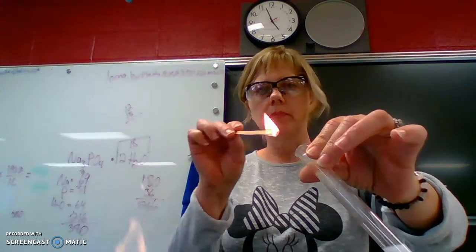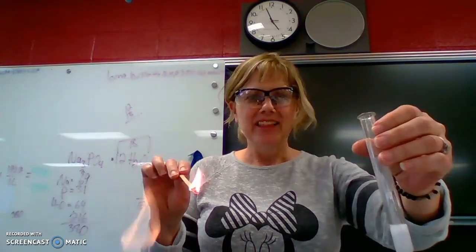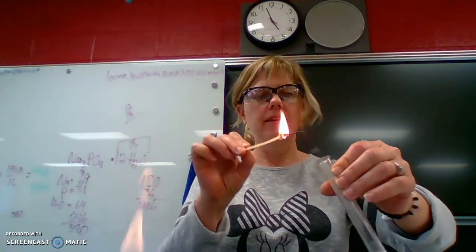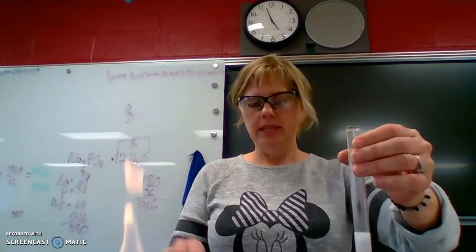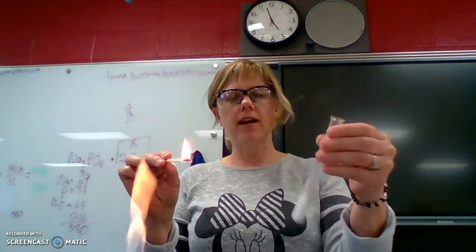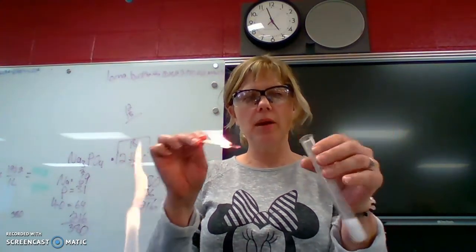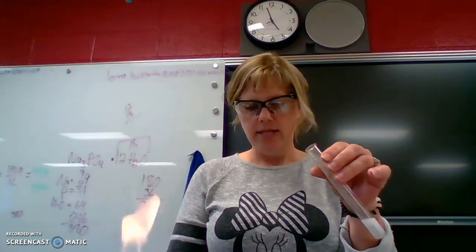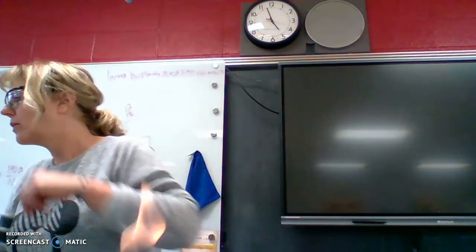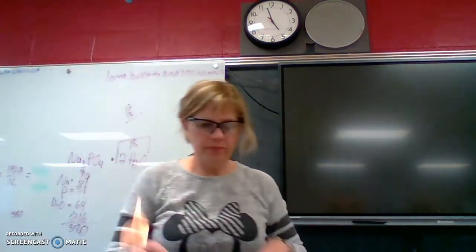So listen carefully. Did you hear that? There's only one gas that tends to react that way. Didn't do it that time. There has to be the right mixture of oxygen. I don't have enough of the gas in there because my reaction is slowing down. But did you hear that popping sound? Ah, I can't get it to go again.